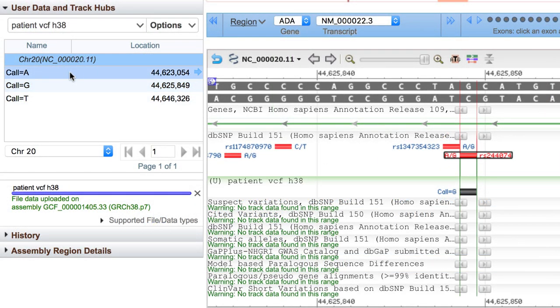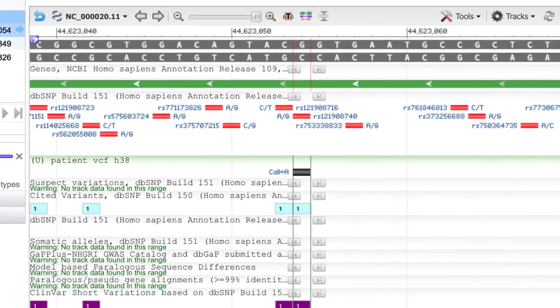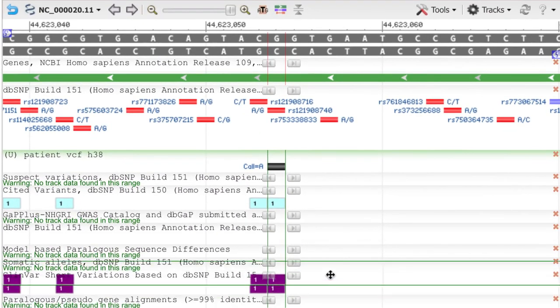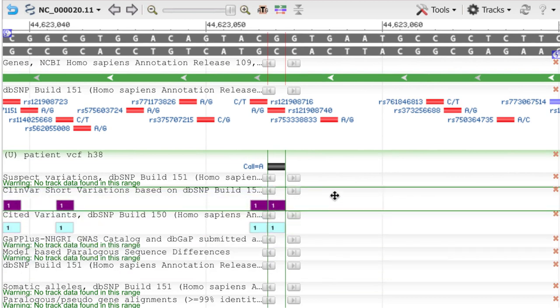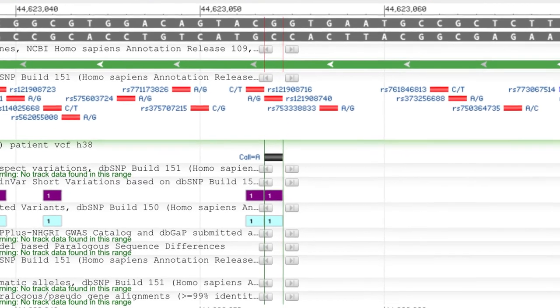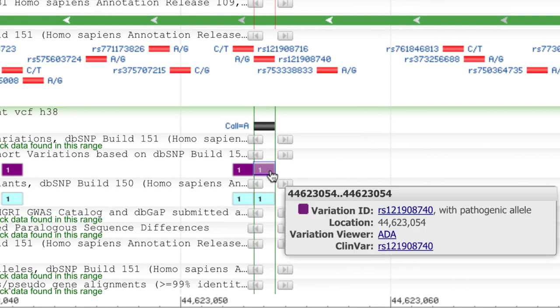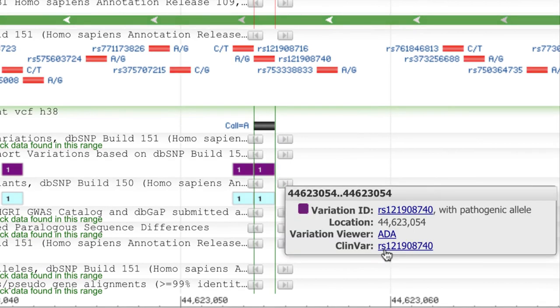Clicking on the A in our uploaded VCF shows a match to a different refSNP, this one ending in 8740. We're still in the ADA gene, and now we see entries in two of our tracks. The purple ClinVar entry indicates a pathogenic allele, and you could explore the ClinVar record directly from here.